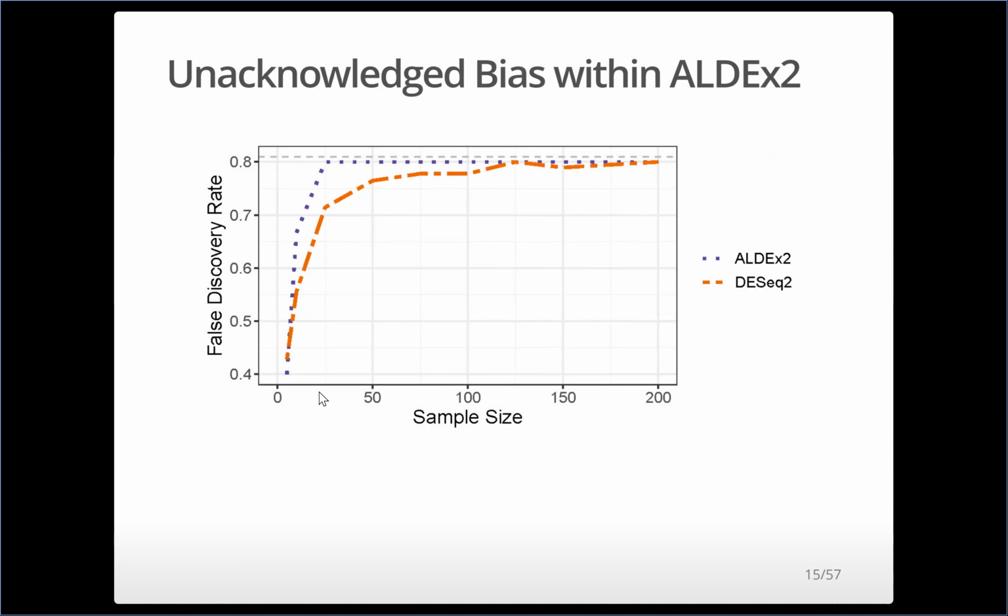You can use whatever information you think is informative for the question you're trying to answer. Some people have talked about, if you have housekeeping gene type experiments, you could use that information to help build your scale model. If you know certain things aren't supposed to be changing, you can use that as a benchmark.